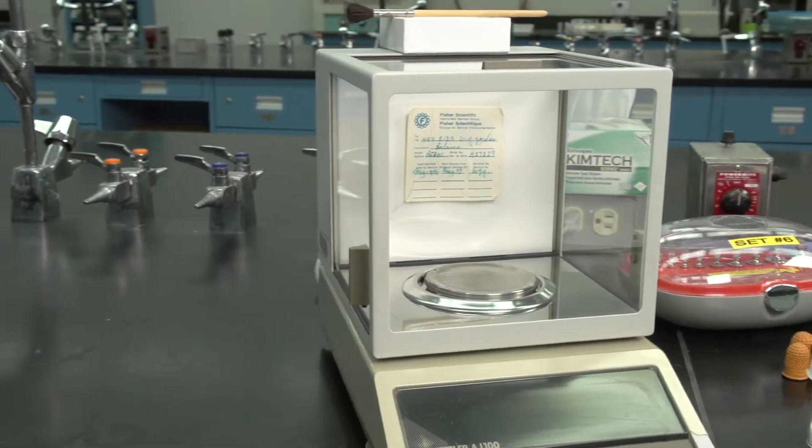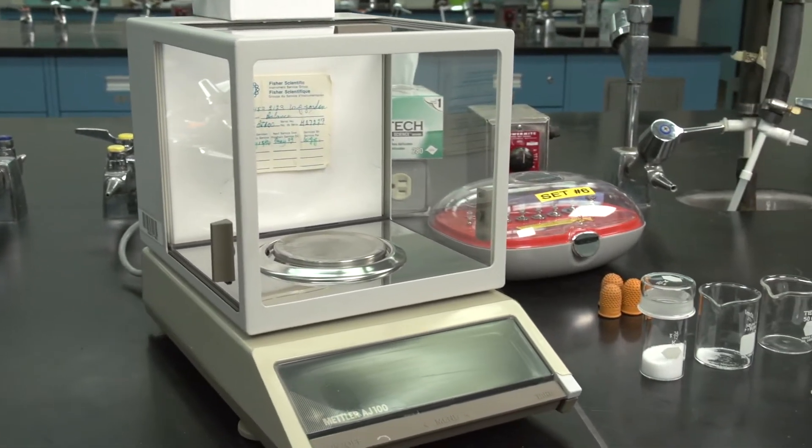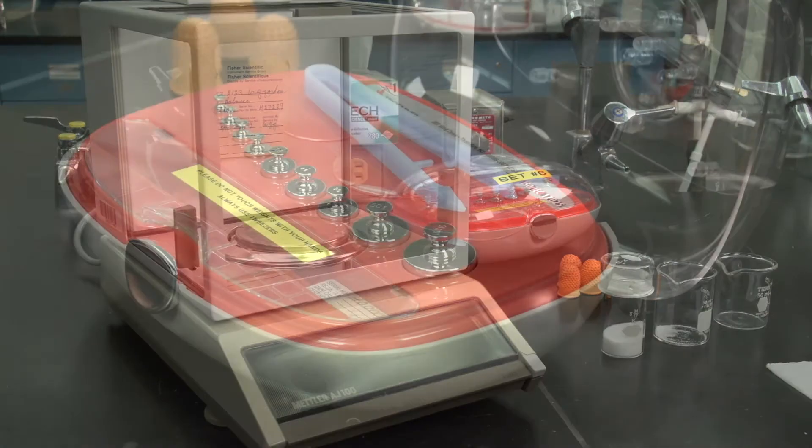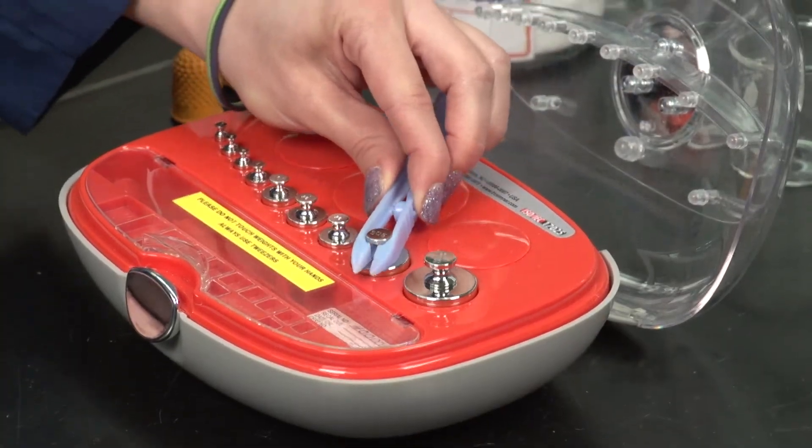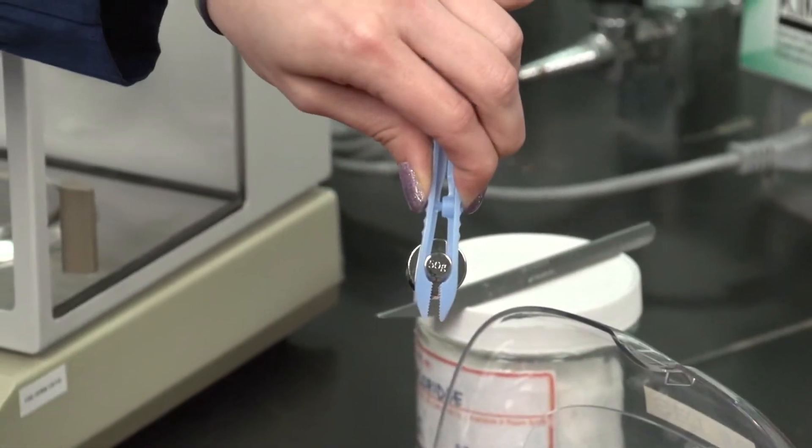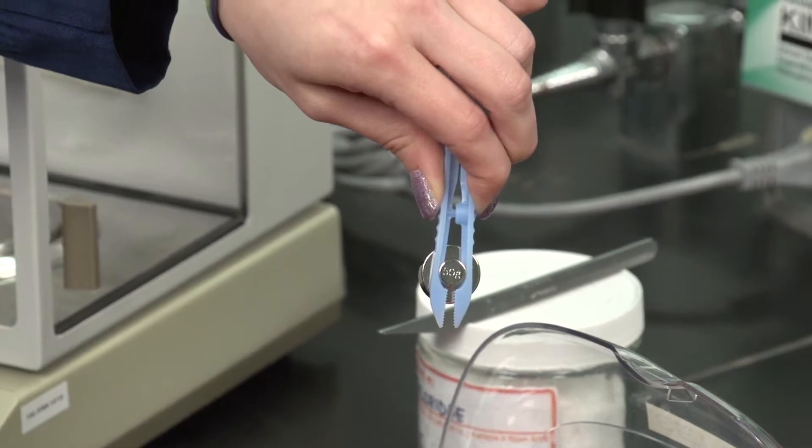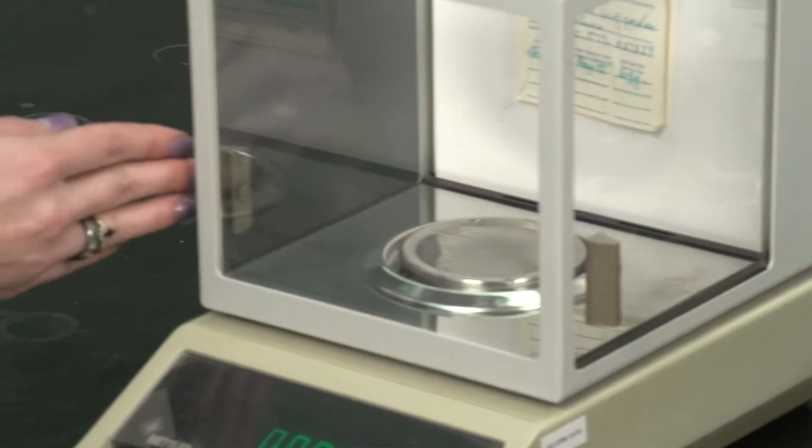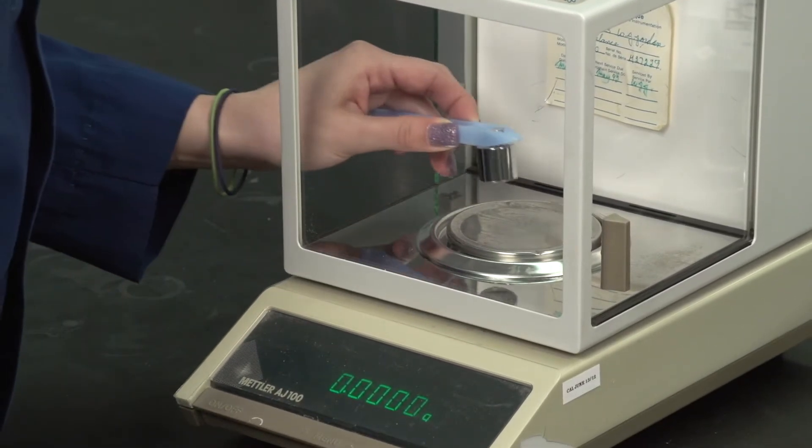Balances must be cleaned at all times and spills must be cleaned immediately. Balances are checked either daily or weekly with a calibration weight according to specific quality control requirements. Typically, analytical balances are inspected annually.